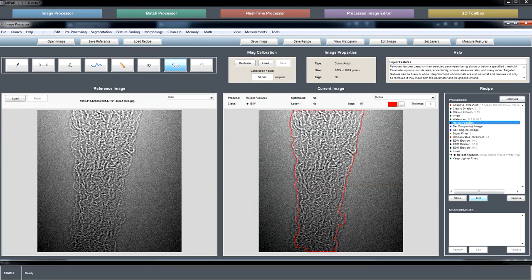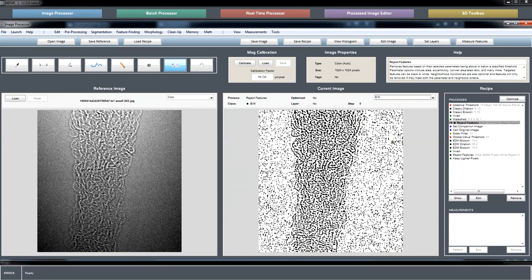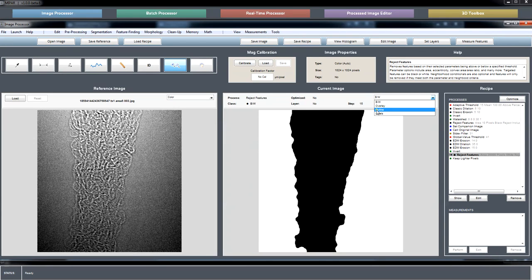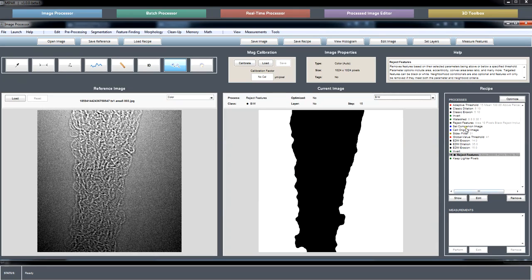In this case, we first found all of the small features that were in the image, and we put those aside in the companion image memory slot, and then we brought back the original and ended up finding just the area of interest, so that between the current image, what you're looking at now, and the one that's in memory, we're going to keep the lighter pixels.